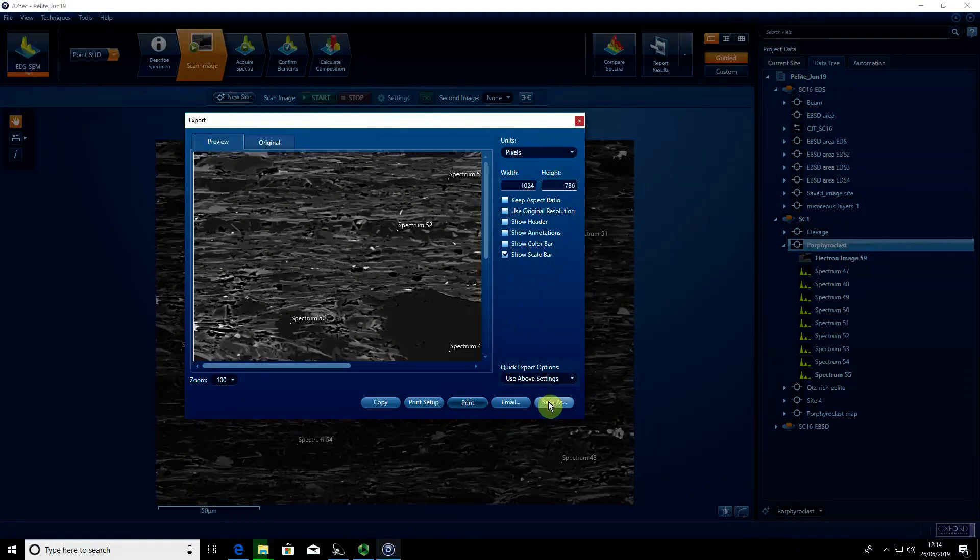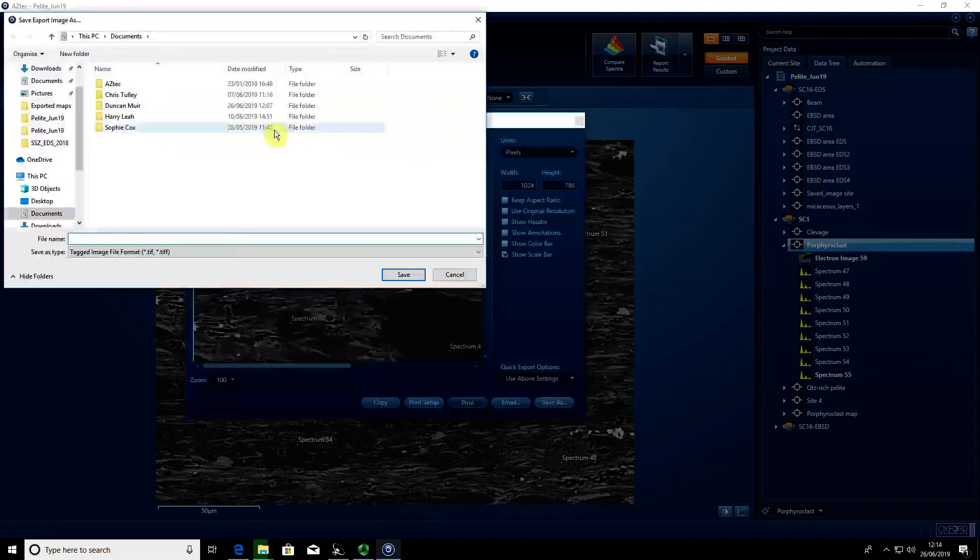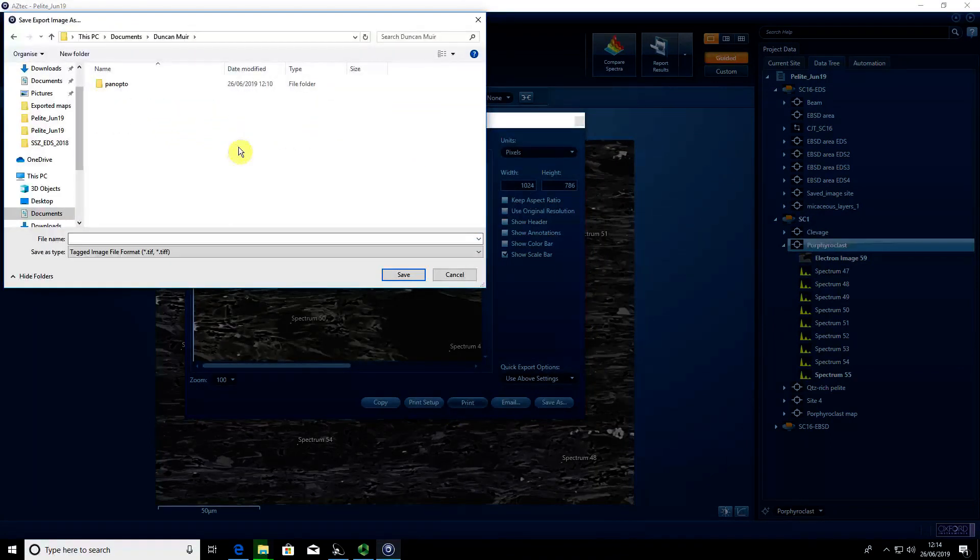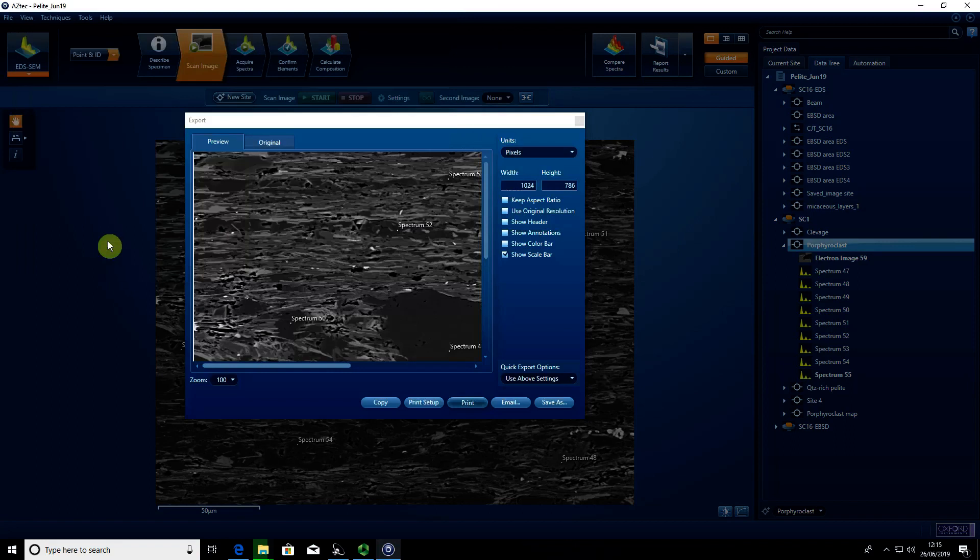I'm going to save as, navigate to my folder, and call it 'test,' then save.